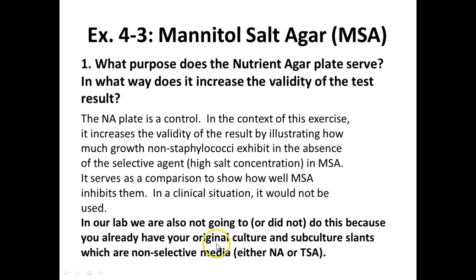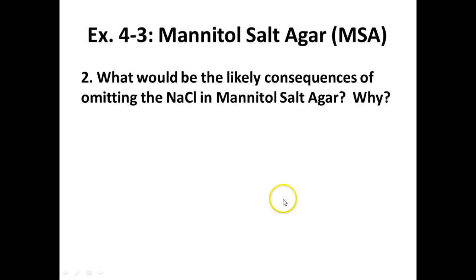We've been doing it, we're just not doing it on plates. In a clinical lab, they wouldn't necessarily do that because they know what results they're expecting to see. But this is to demonstrate to you that it is the media that's really causing these differences, and that's why we're not seeing growth.